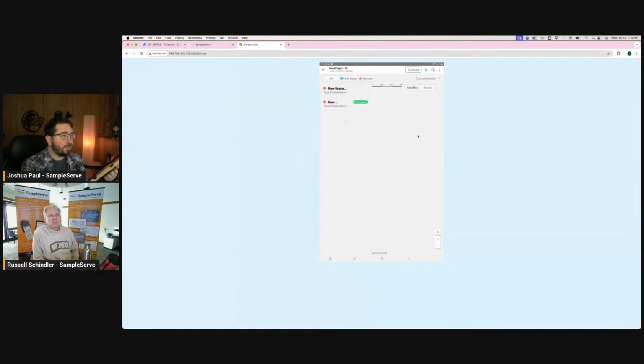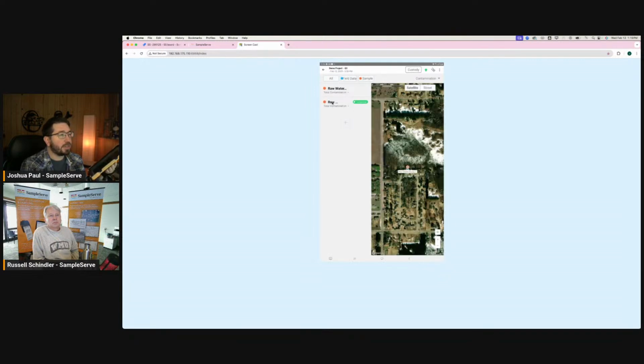Now let's hit continue. It'll show that this sample location is now completed. I've done this. If I had somebody else out in the field that was connected to the internet as well, they would see that this is also completed, so they would know that the other person has completed the sample location. So I have one sample in my custody.